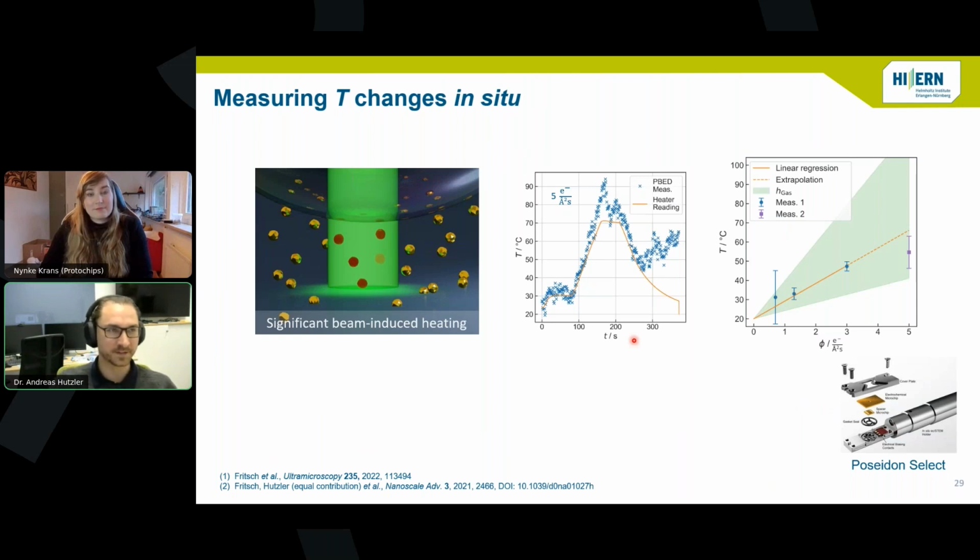If you heat the sample up, it might expand to some extent, right? But if you just study temperature at room temperature, you can say, okay, there will be no bulging apart from the bulging that you induce by your liquid pressure or inlet pressure. So you can say, okay, maybe I don't care, and then you can still do temperature-related measurements.